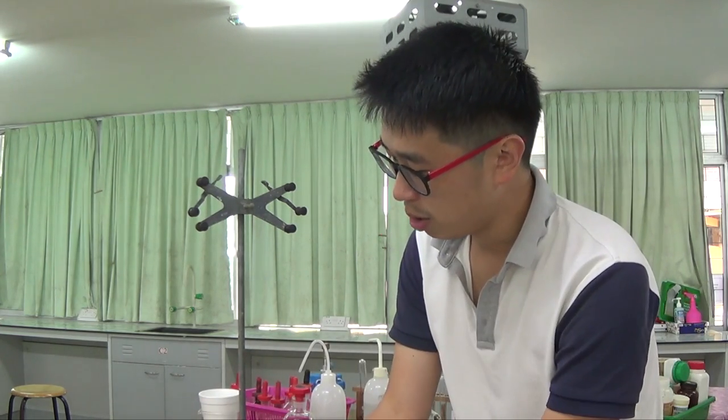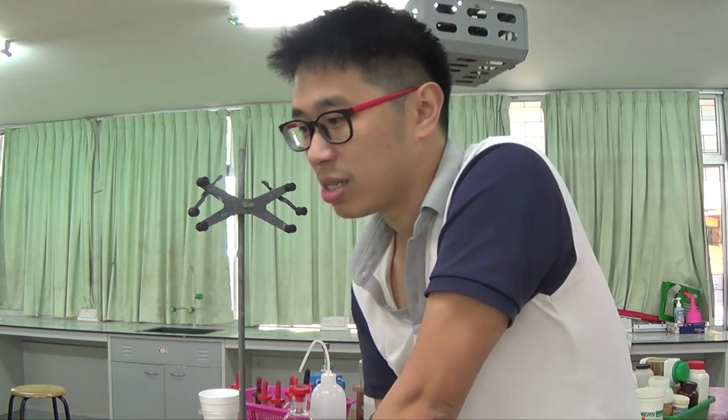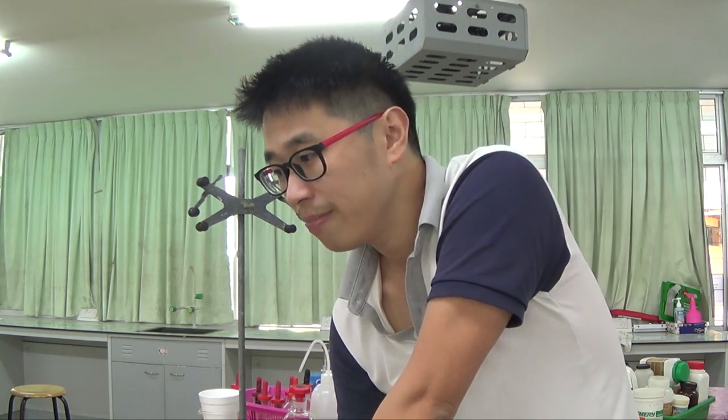Okay, so a bit of suggestion to improve the experiment to start with, but these are the kind of things that usually appear in the alternative to practical, for example, which of course is an O-level kind of paper, or it could be in a real practical paper like this. I think there's a question on suggest how to improve the experiment. It could also be in Paper 5 in A-level, experimental planning and design, in terms of suggestion, as well as the practical paper in A-level as well. Okay, so practical is pretty much the same whether you're doing O-level or A-level or IGCSE. It's still the skill, the method.